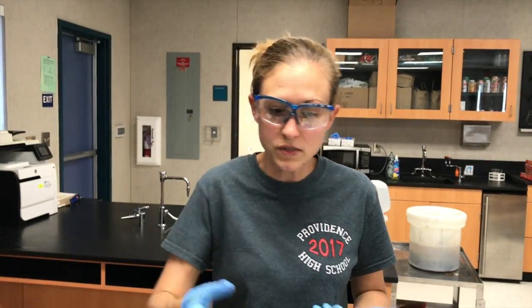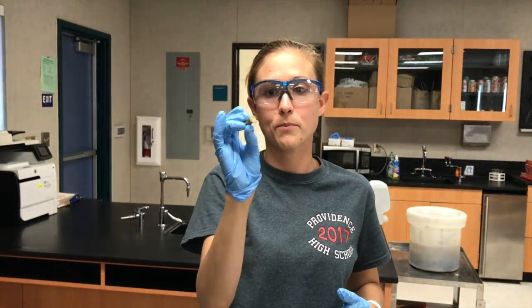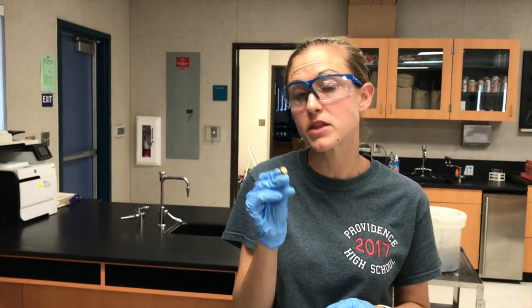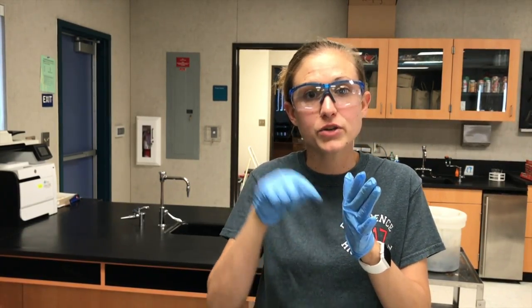So in this lab, we're going to be making a copper solution using our brass shell casing. And that's going to be blue in color, and using our spectrophotometer, which I'll show you in 1 second, we'll be able to determine the concentration of copper in the solution by finding absorbance. But in order to do that, we need to create a Beer's law curve. And so that's going to compare concentration and absorbance, and we will actually create that curve.